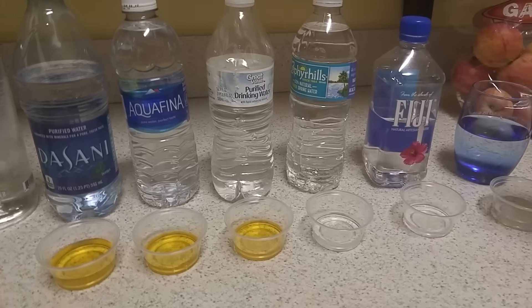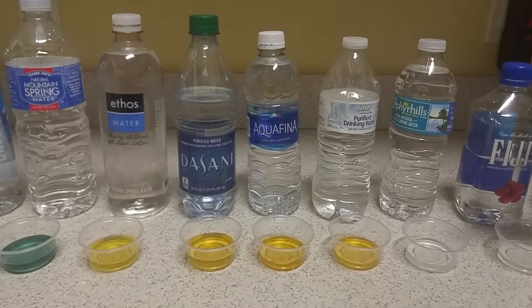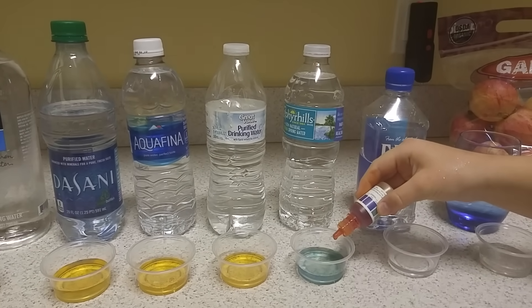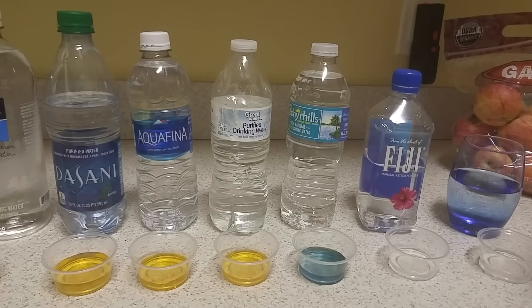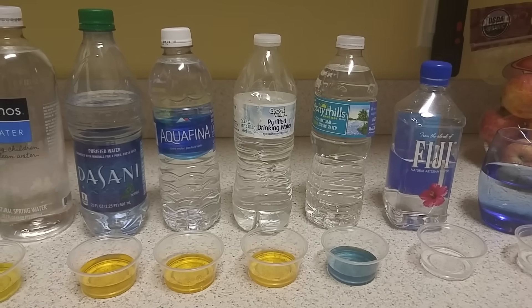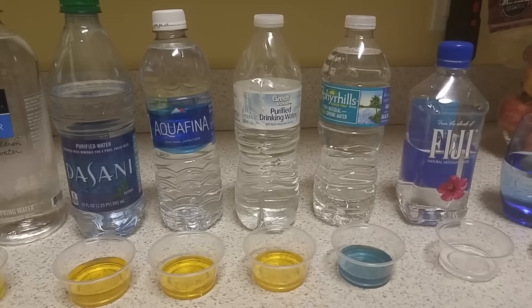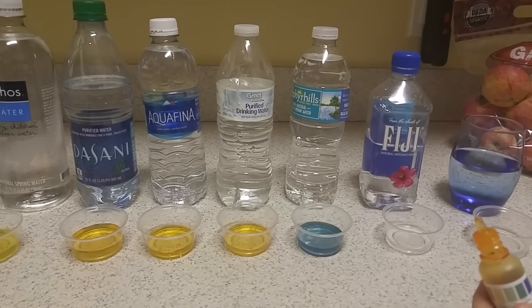Zephyrhills — this is our brand in Florida — also acidic, garbage. Look how many of these are so acidic. Wait — it's not bad. That passes! It's around a 7.5, almost an 8 — definitely neutral, a little bit more on the alkaline side.